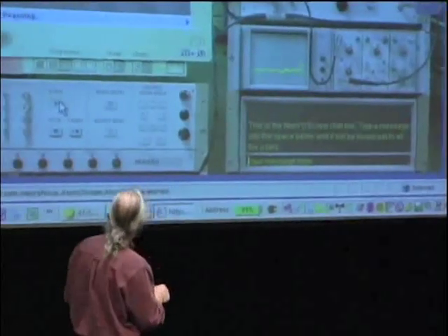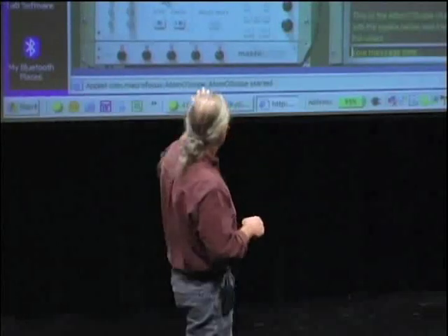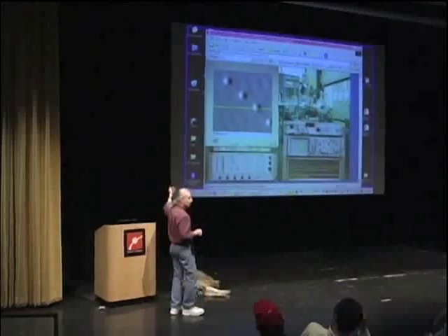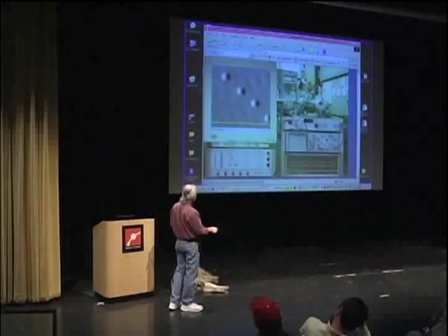And then, over here, we're seeing the area that we're imaging. I'm guessing that it's about 8 nanometers by 8 nanometers in size. It's roughly about what it is. And the grayscale that you see here is being applied as if there was a light source shining from left to right. So these are bumps on the surface. And you can see the bumps show up over here.